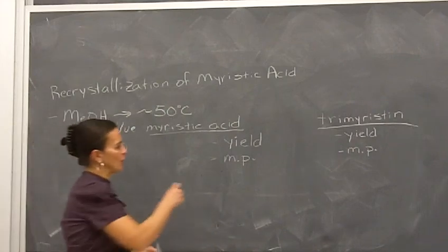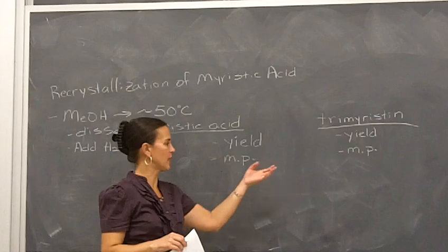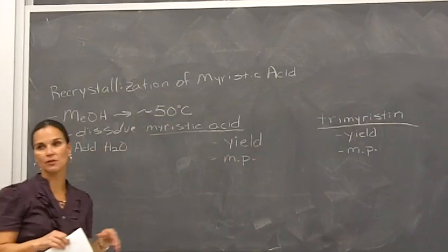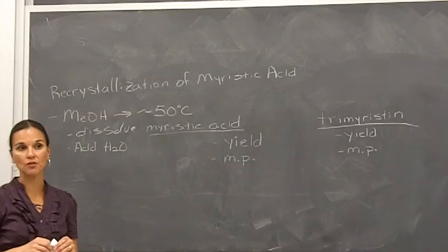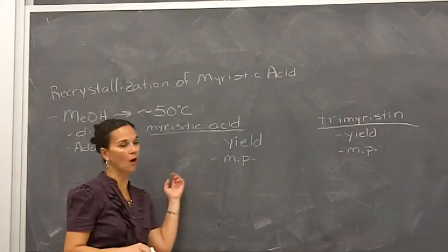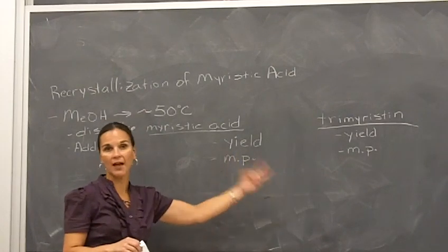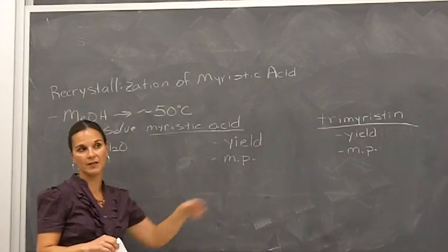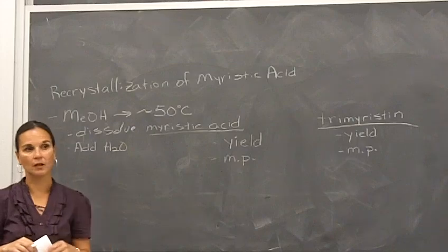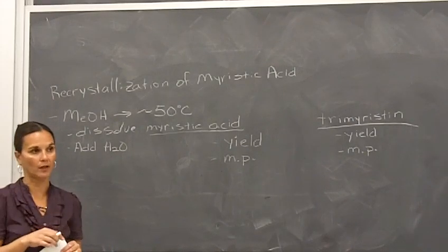Now the other thing with the melting points, because you know about what temperature they should melt at, and it's low enough you don't have to do a fast melting point range, so you can just do a slow melting point range, all right? And you could actually do all three of them all at the same time. So you could do myristic acid, trimyristin, and the mixed melting point range all at the same time because there's 3 slots in the melt temps, right? So you could collect them all at the same time and not have to do one by one by one individually.